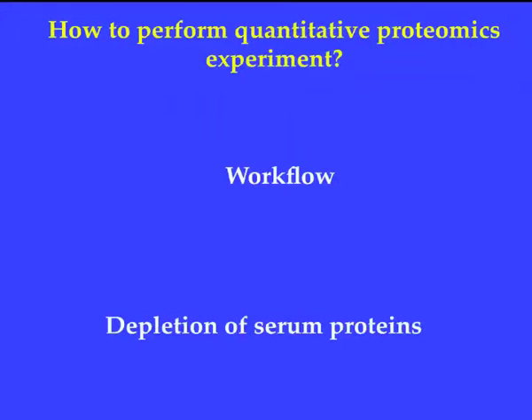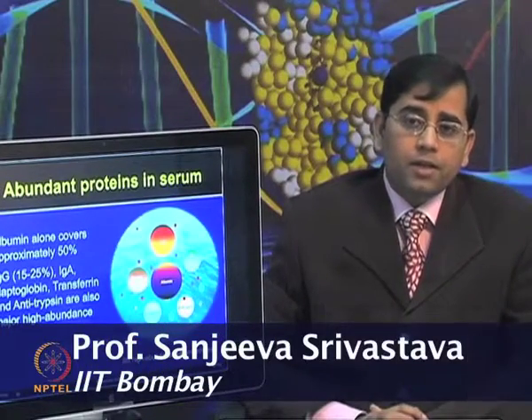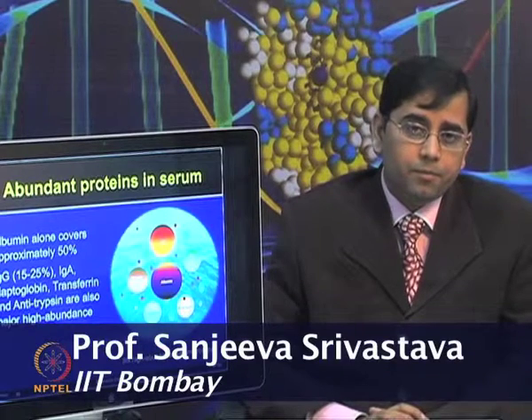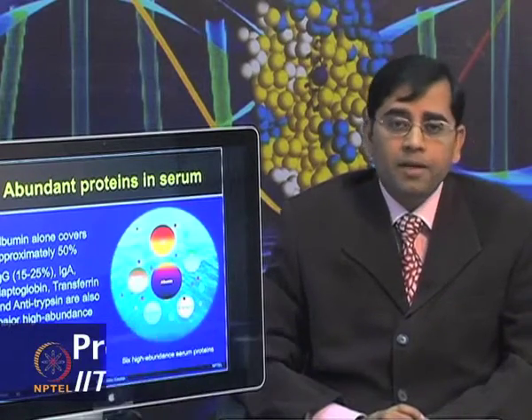How do we remove the high abundant proteins present in the serum? As we talked about, there are more than 20 abundant proteins present in the serum, and albumin alone covers approximately 50% of these abundant proteins.